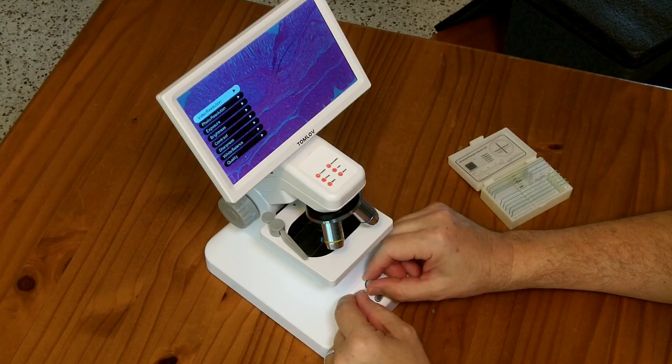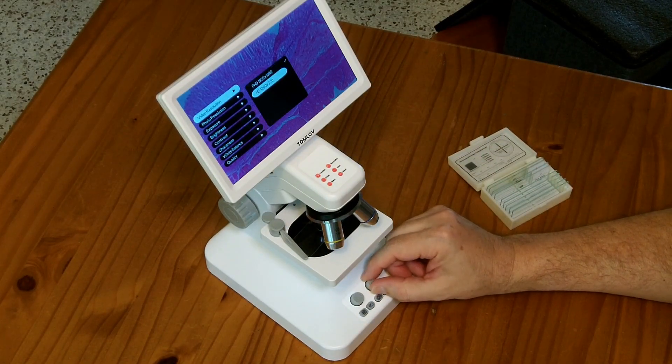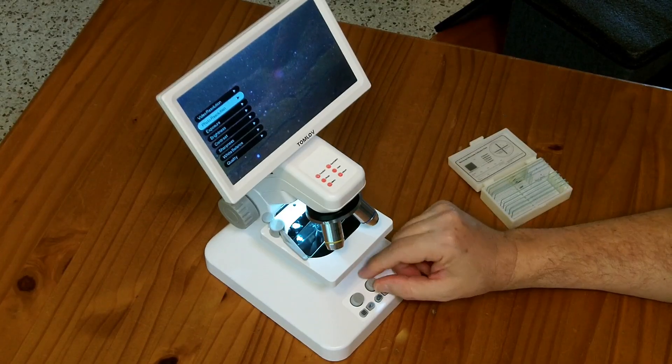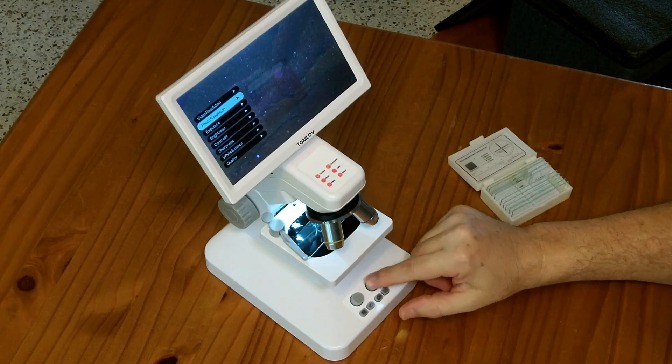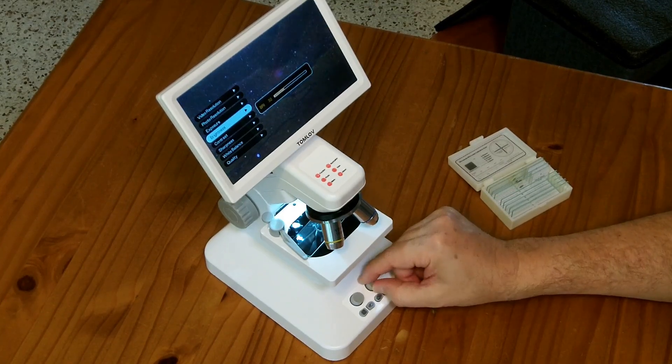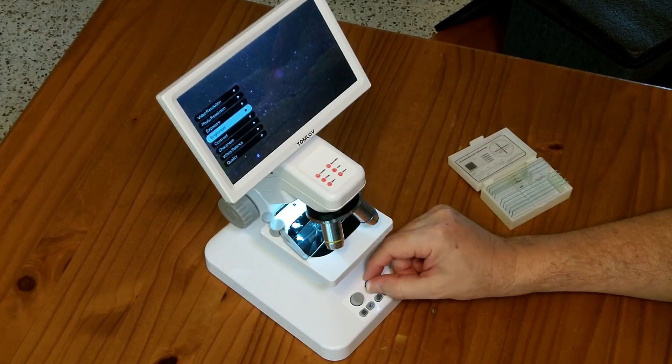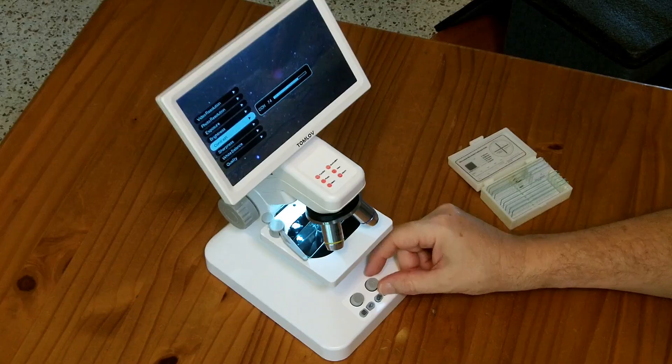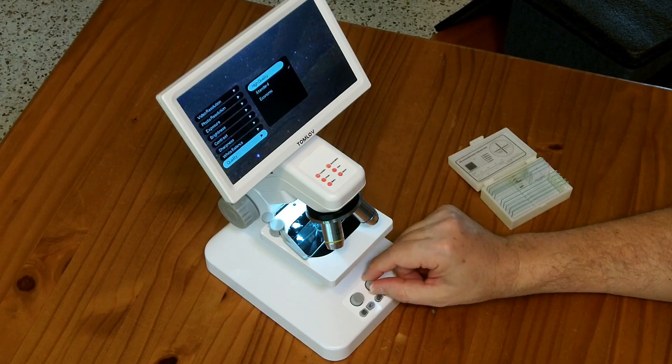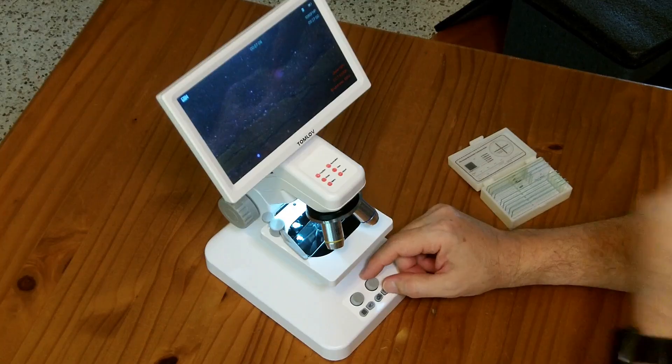Now there is a menu here. And you can change various aspects. You can change it from FHD to just 720. So there's 1080 or 720. Photo resolution can go up to 8 megapixels. So it's 3856 by 2160. Here the exposure is zero. Brightness level. That is of the screen, I believe. Well, no, it's actually more of the camera's brightness level. So you can adjust these things. I believe that there is a lot of auto adjustment going on. But you can adjust the contrast, sharpness, white balance, something called quality. You can do standard, economic, or high quality. I see no reason not to go for high quality. So there's not a lot of settings to change. But anything you might want to change about it, you can.